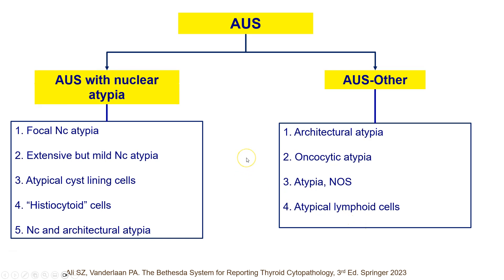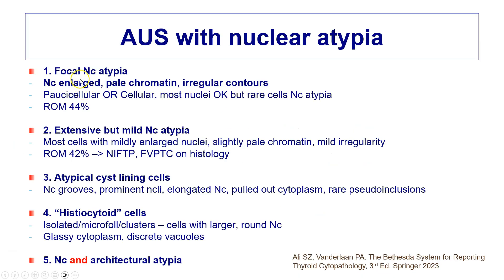Let's start by looking at AUS with nuclear atypia. Firstly, there is focal nuclear atypia, where cells exhibit enlarged nuclei with pale chromatin and irregular nuclear contours — raising the possibility of papillary thyroid carcinoma — but there are insufficient cells. The specimen may be paucicellular or cellular but with only very rare cells showing nuclear atypia, insufficient to call it suspicious for PTC.